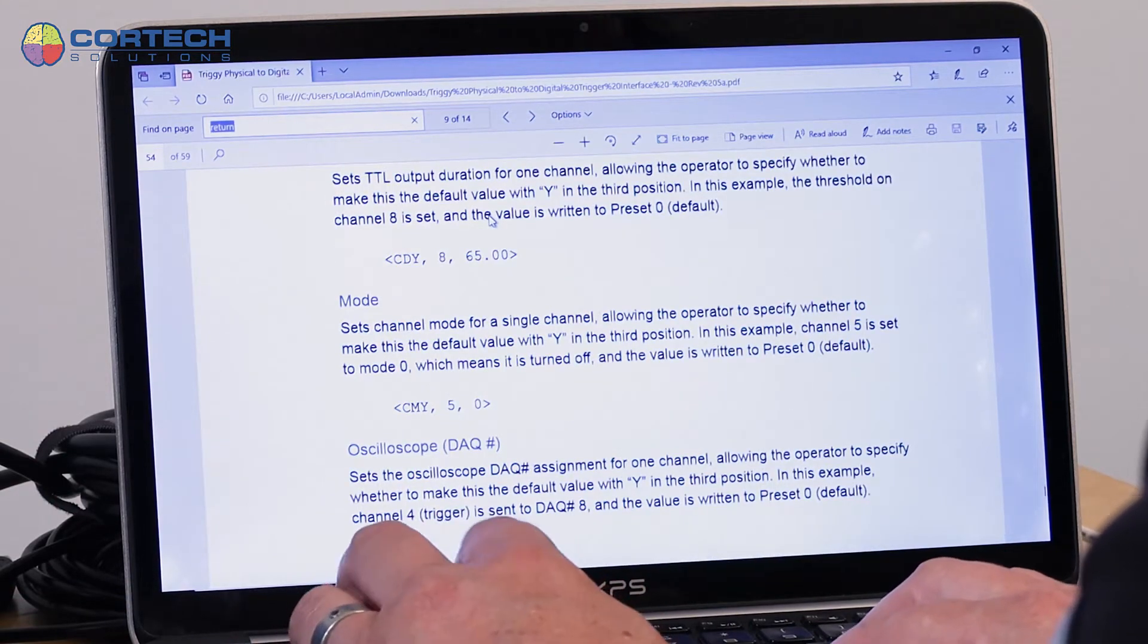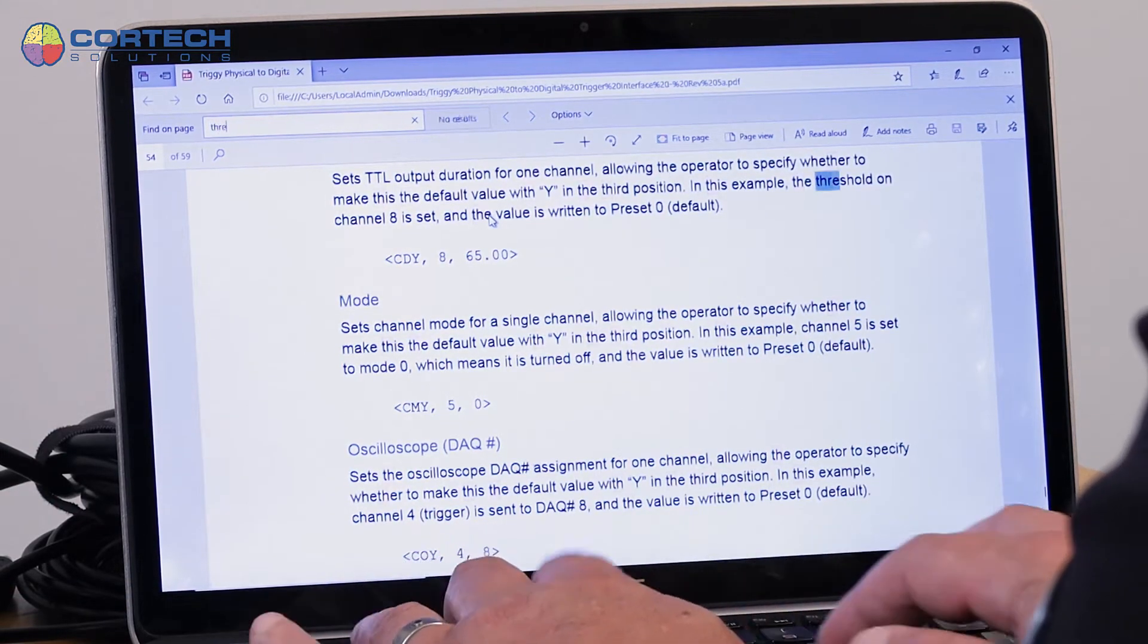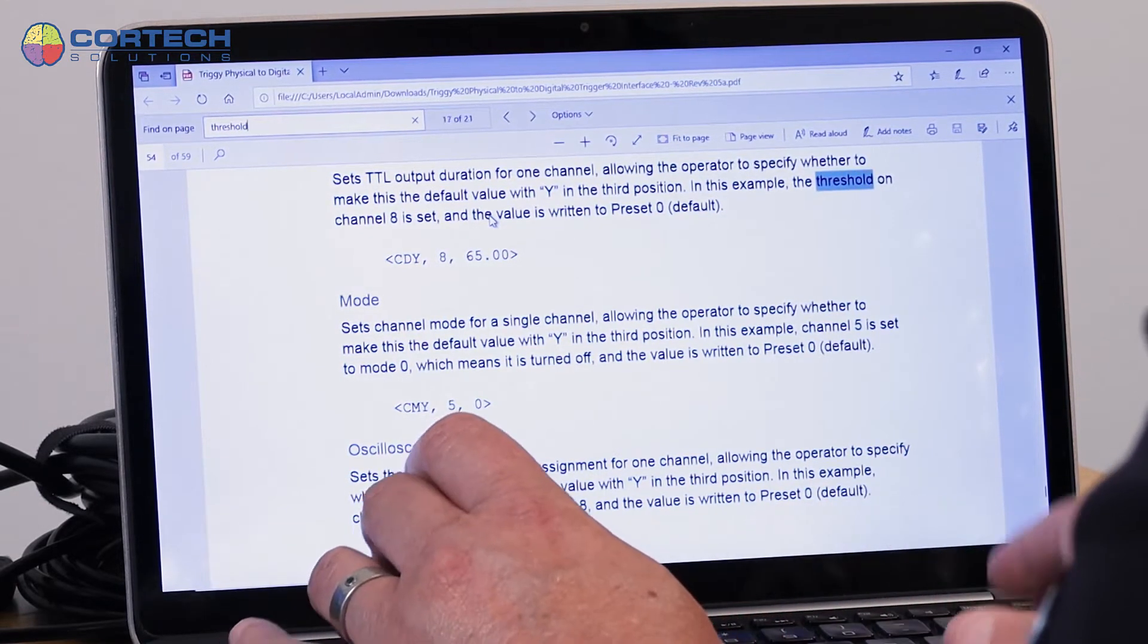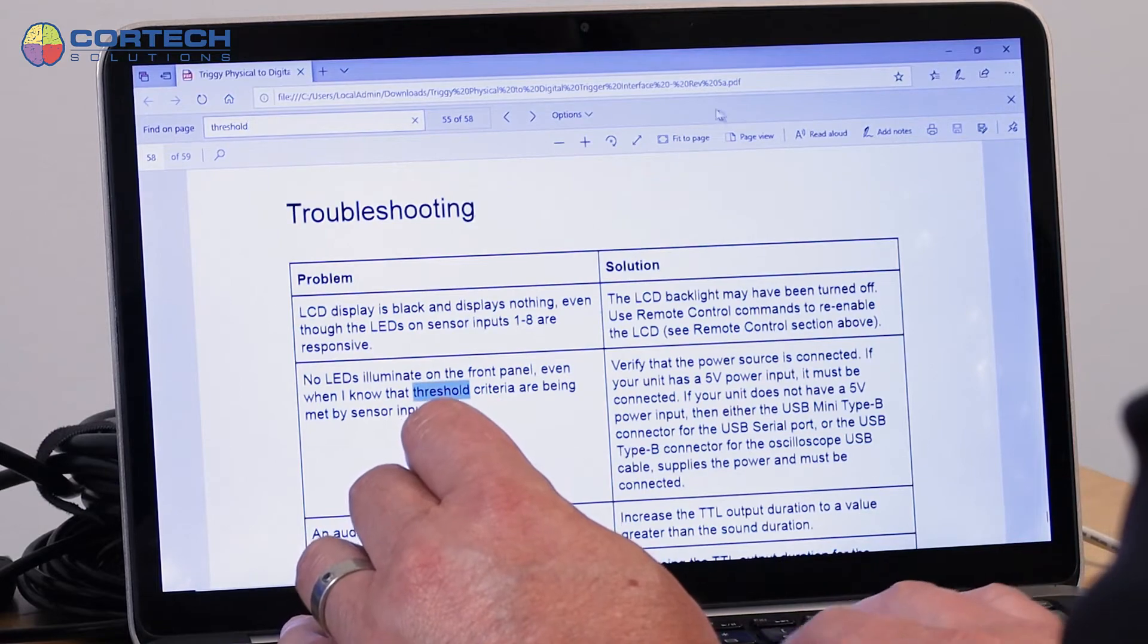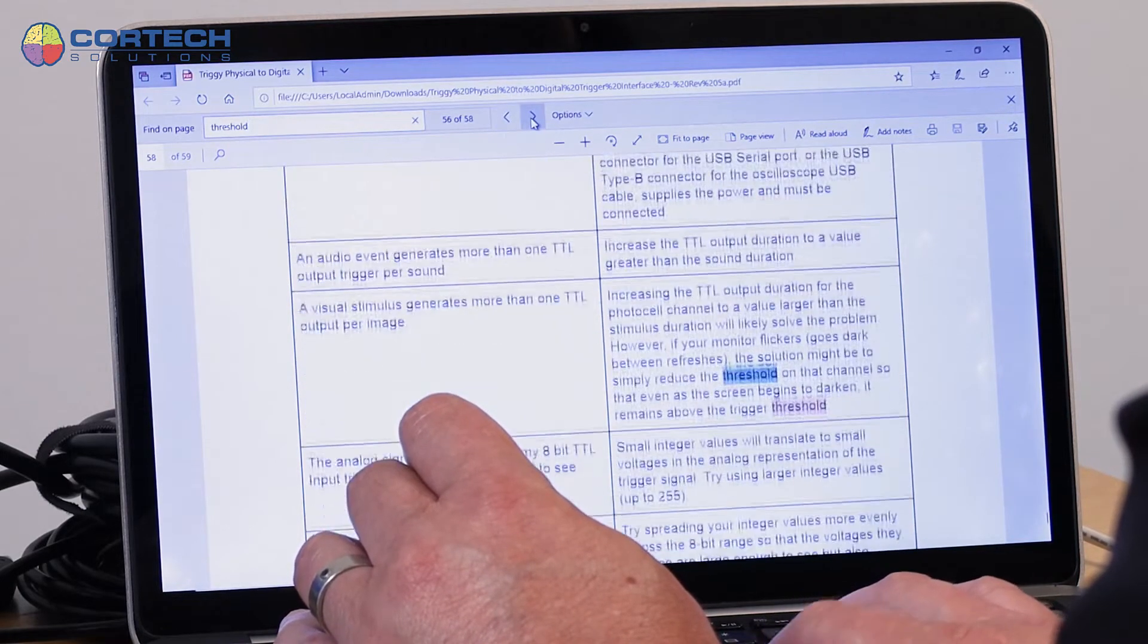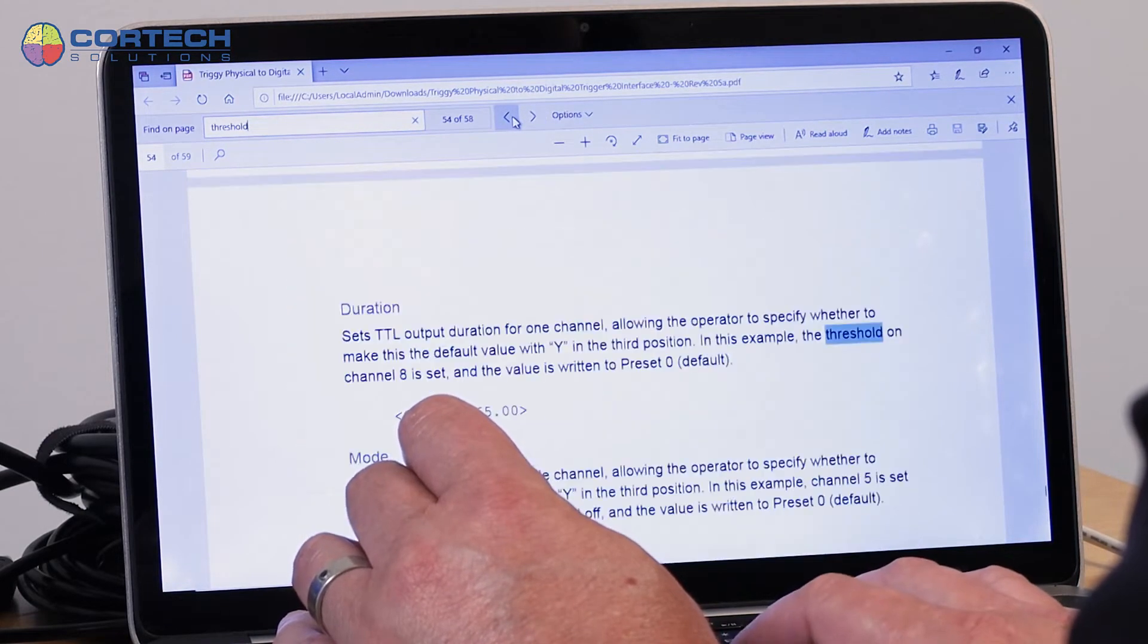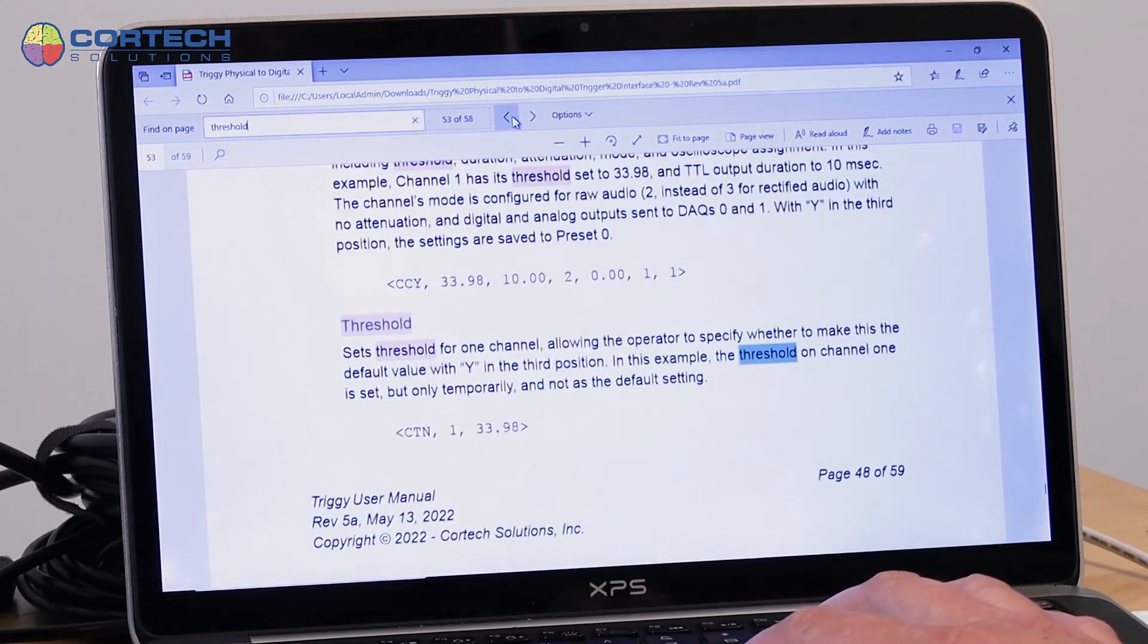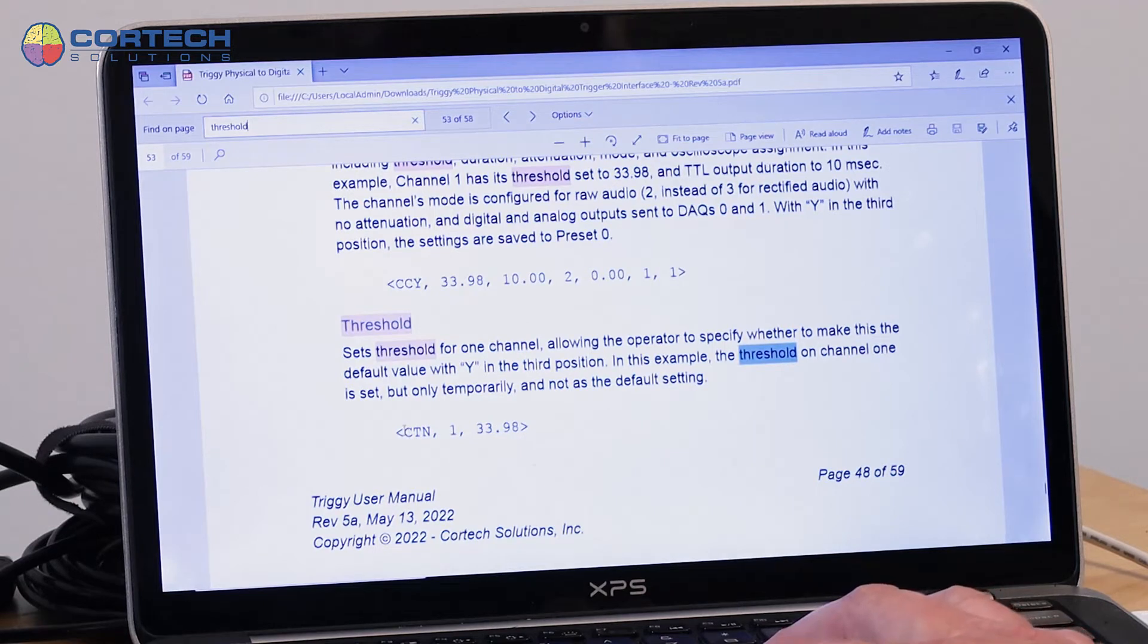So let's look for a threshold. I can set the threshold with this command. Configure threshold, and then the end is to not set it as the default on channel one.